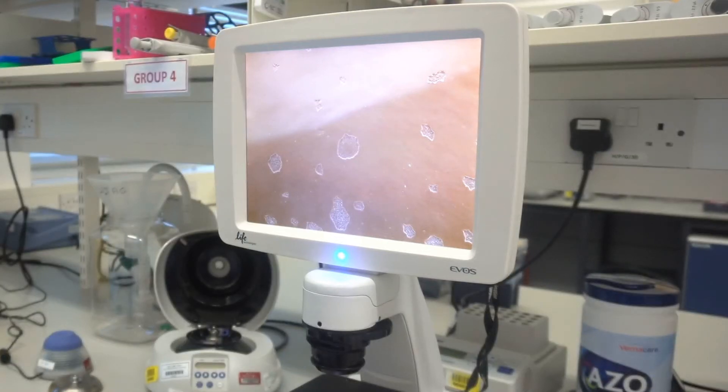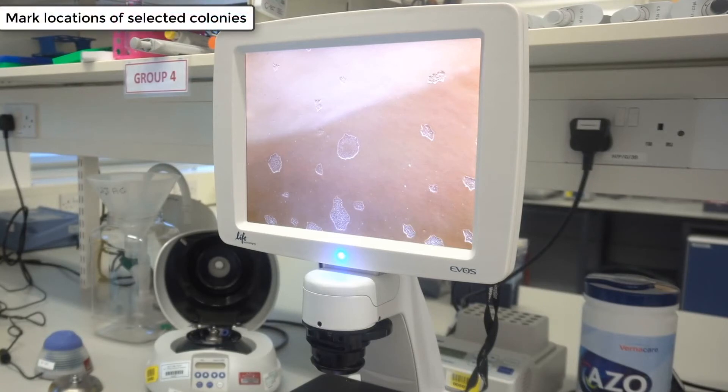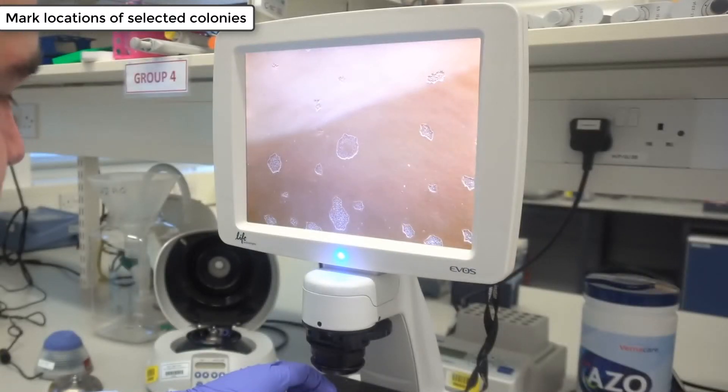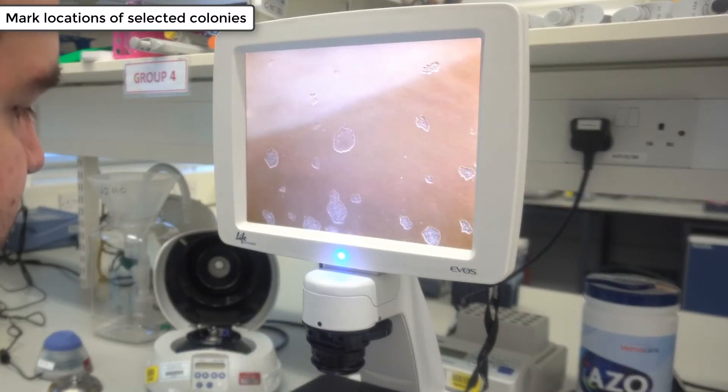Once you've selected your colony, it's worth marking on the underside of the plate which colonies you've selected. This is because if you leave any cell fragments behind they can regrow, and if you come back to colony pick at a later date you could accidentally select the same colony you've previously picked. We recommend working on a clonal basis.